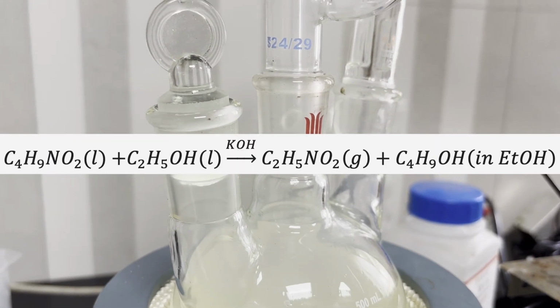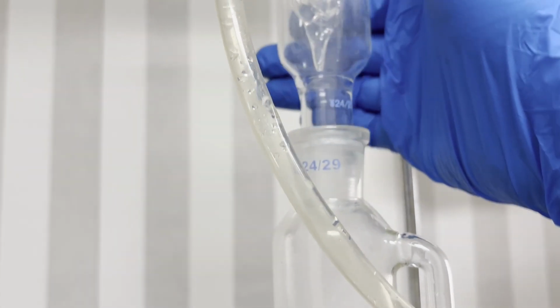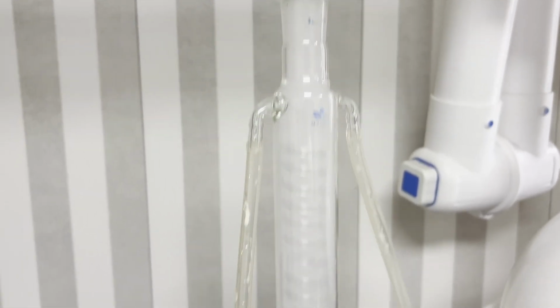flask. Note that ethyl nitrite may be produced from a transesterification reaction, and due to its very low boiling point of 15 degrees C, it escapes out of the condenser as a gas and carries out the azide fume. I placed a piece of glass on the top of the condenser to block the fumes from releasing.